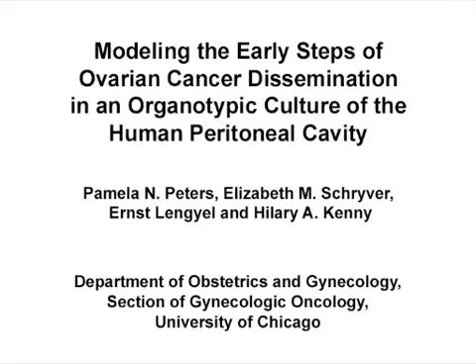The overall goal of this experiment is to create an organotypic model that mimics the peritoneal microenvironment to better our understanding of ovarian cancer biology.